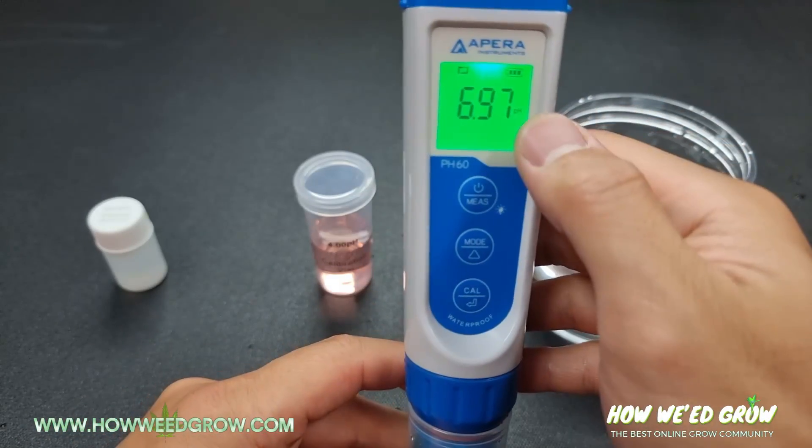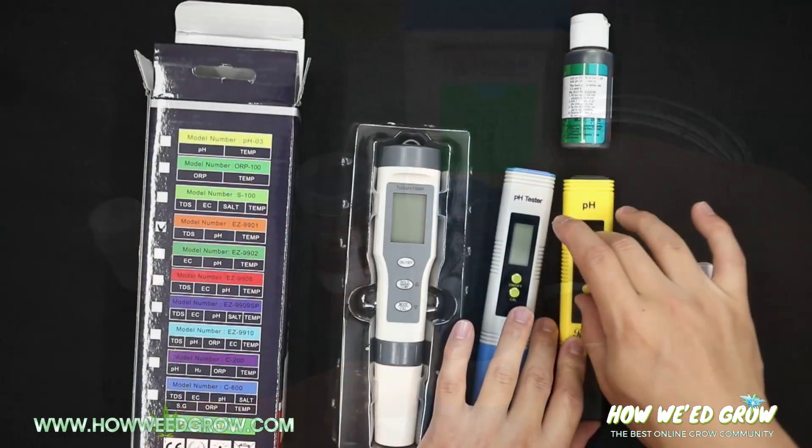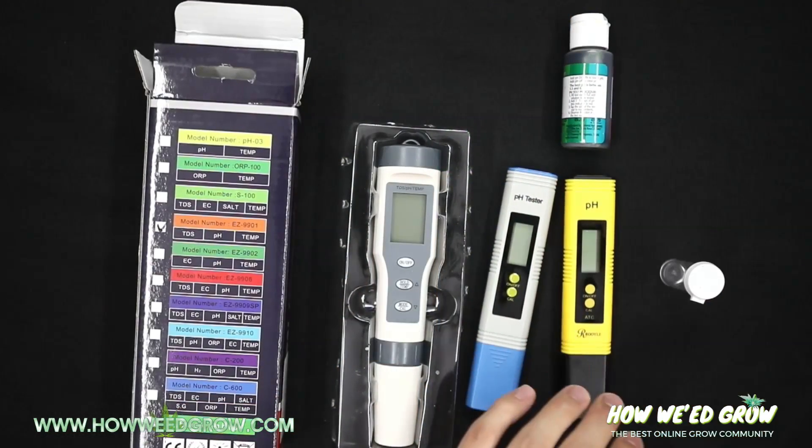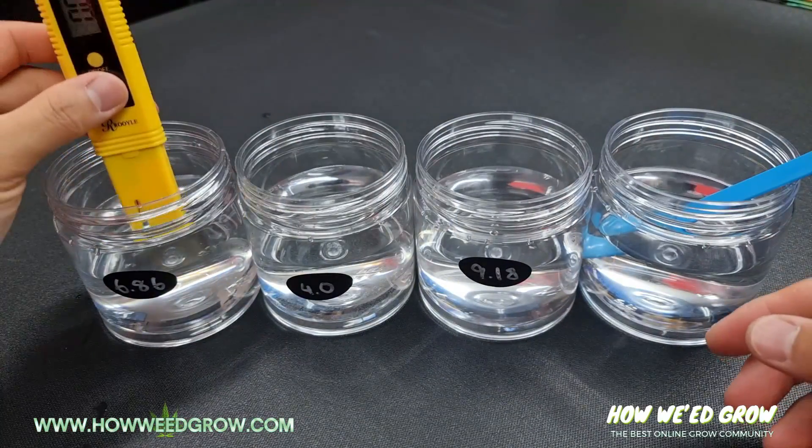I can't stress the importance of using your pH meters properly. Even the cheap ones can be used for years as long as you know how to use and maintain them.